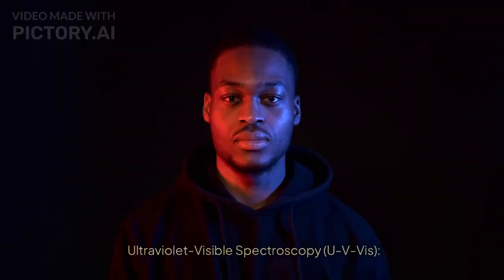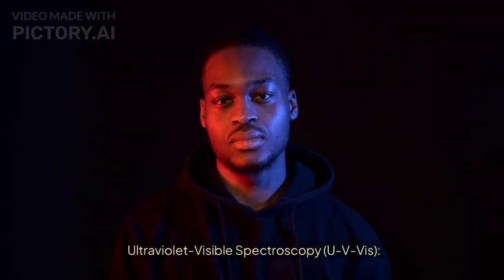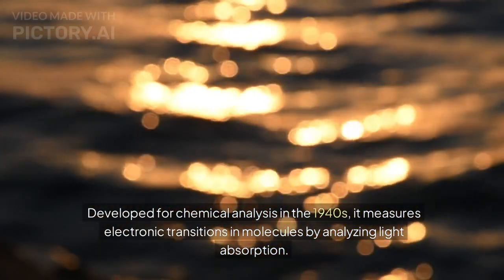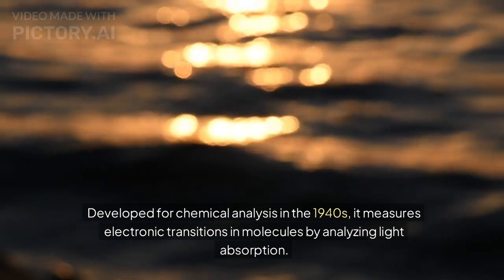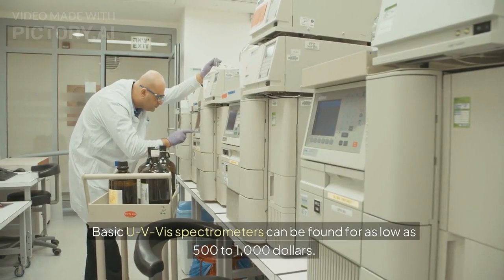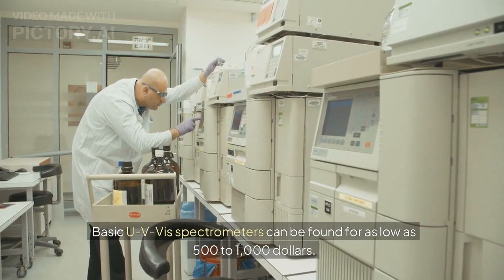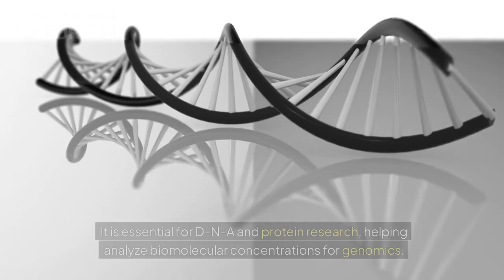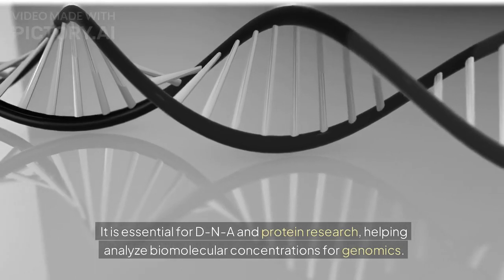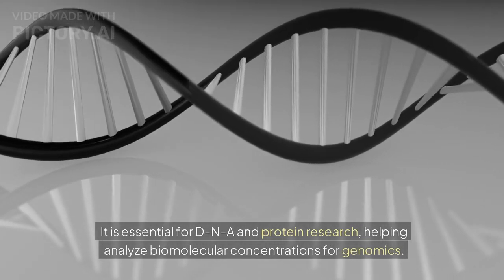Ultraviolet Visible Spectroscopy, UV-Vis, developed for chemical analysis in the 1940s, measures electronic transitions in molecules by analyzing light absorption. Basic UV-Vis spectrometers can be found for as low as $500 to $1,000. It is essential for DNA and protein research, helping analyze biomolecular concentrations for genomics.